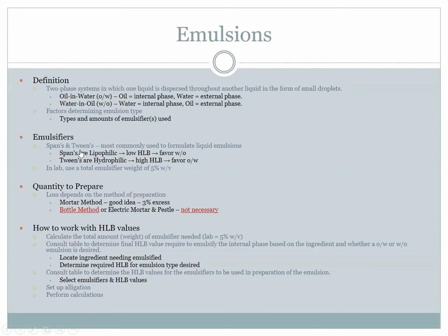Well, the point is that what type of emulsion you want depends on the amounts and the types of emulsifiers. So if you want the water to be dispersed in the oil, or conversely, in the dry lab prescription that you want, we want the oil, the gross tasting part, to be dispersed within the good tasting part, which is the watered cherry syrup. So we want an oil in water for your dry lab prescription, for example.